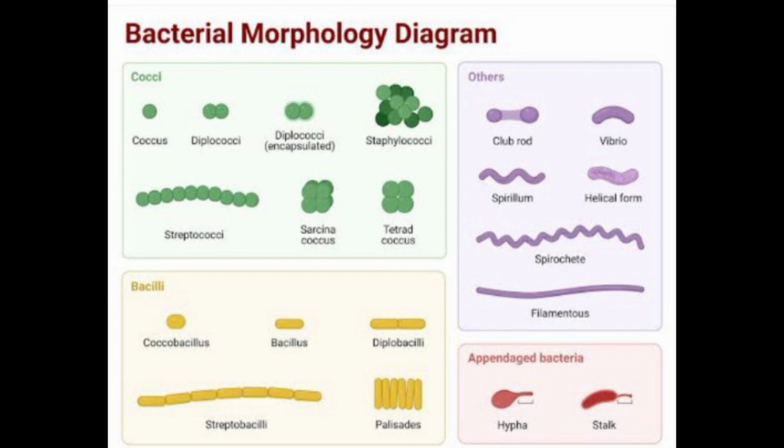The visualization of bacteria generally requires the use of immersion oil with the 100x objective. This combination results in a resolution of approximately 0.2 micron. However, the 40x objective is used for examination of wet preparations, for example hanging drop, stool for ova, and phase contrast microscopy.